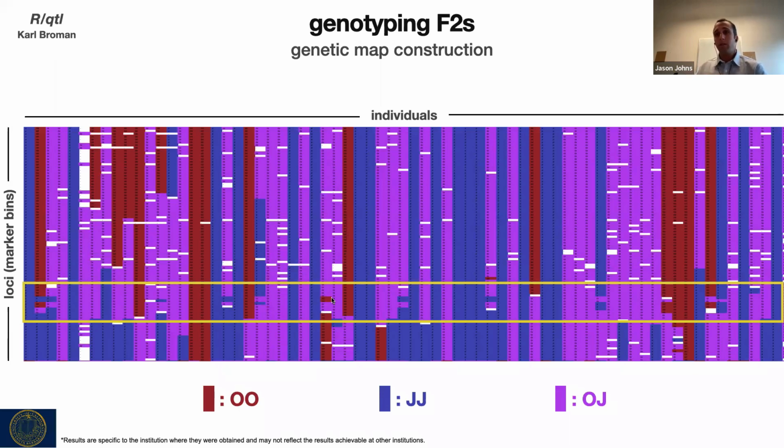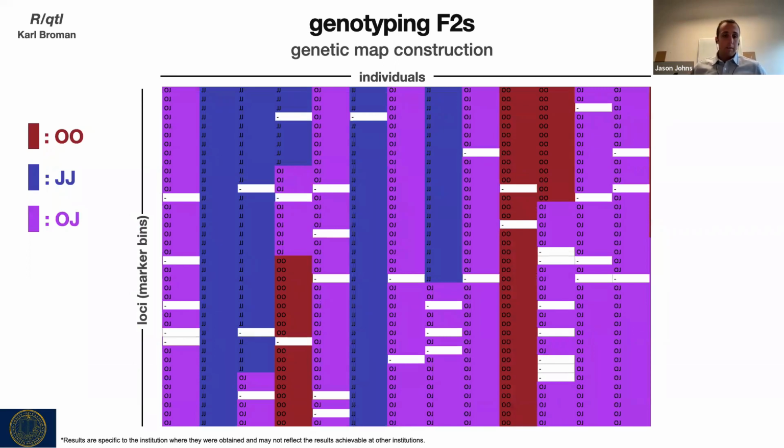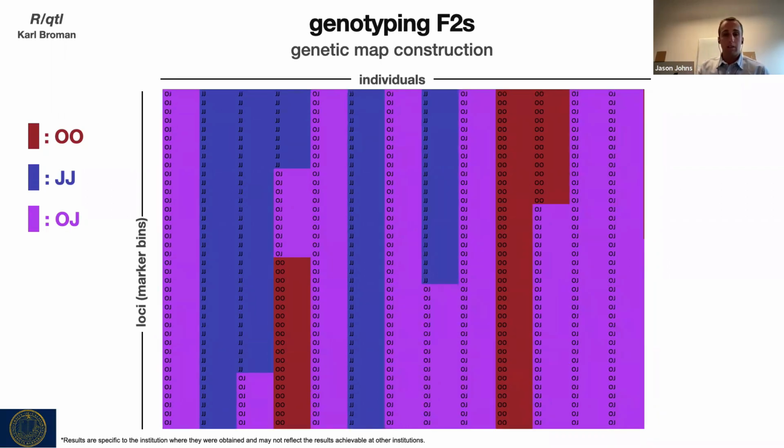So we ended up doing some manual rearranging based on parsimony, essentially, and what made intuitive sense. One other thing that we did manually with our genetic map was to fill in some genotypes based on intuition. The odds that there would have been two recombination events here, and there would be any genotype other than heterozygous or homozygous Jonesii, is really low. So we felt good about filling in these unknown genotypes that were surrounded by blocks of the same genotype.